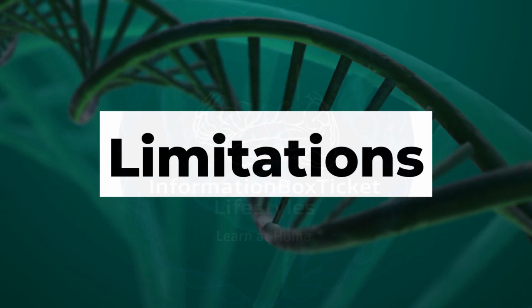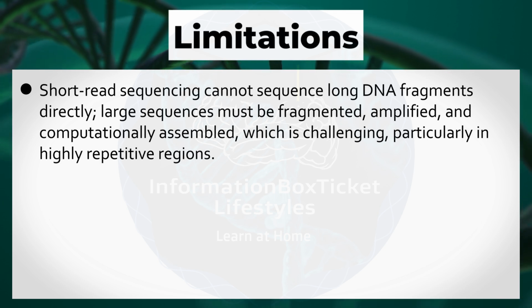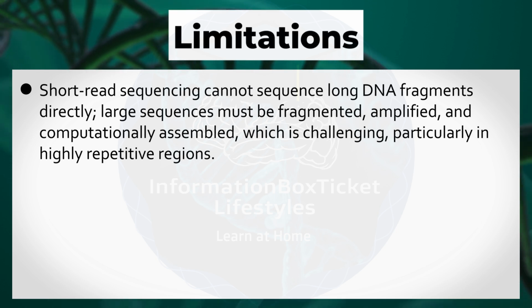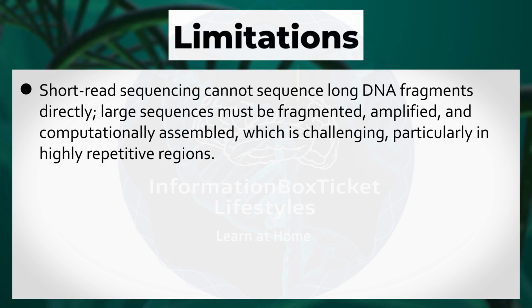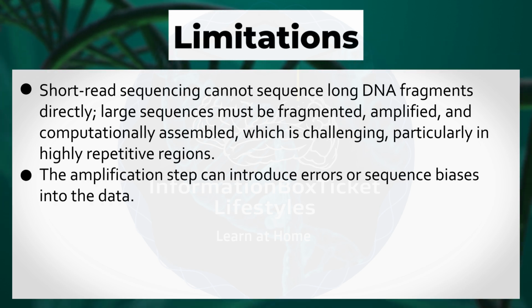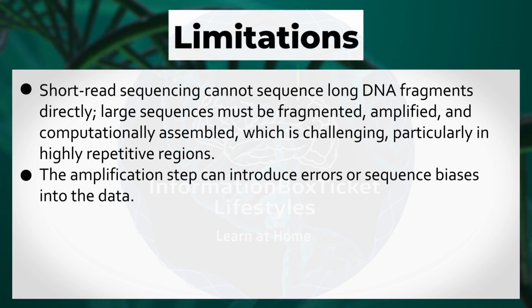Limitations of short-read sequencing. Short-read sequencing cannot sequence long DNA fragments directly. Large sequences must be fragmented, amplified, and computationally assembled, which is challenging, particularly in highly repetitive regions. The amplification step can introduce errors or sequence biases into the data.